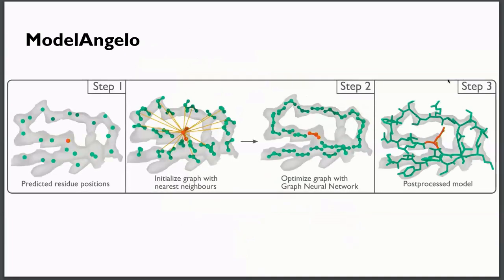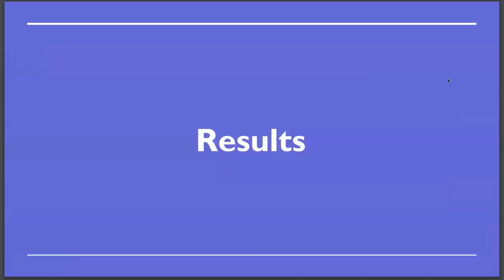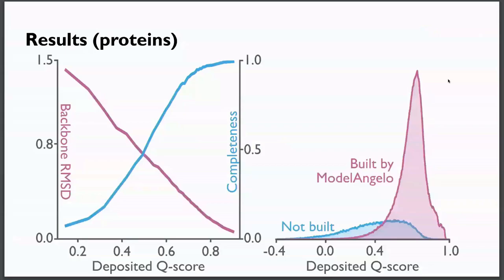So this is the full pipeline for ModelAngelo. Now we are going to look at how well it performs. ModelAngelo's training cutoff date was April 2022.